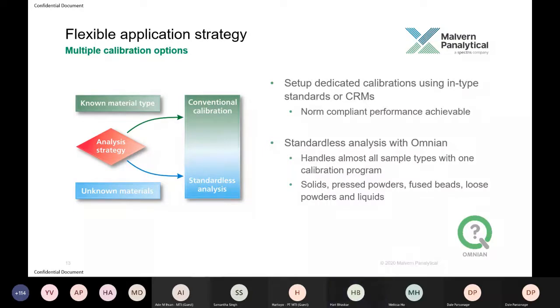We do also have a standardless analysis program, which is able to be calibrated on the Epsilon 4. It's called standardless, but it is initially calibrated with a set of standards. However, within the software, it allows for flexibility and also interpolates certain other elements based on the intensities of the known standards. By doing that, you can deliver the periodic table from fluorine to uranium after one calibration.